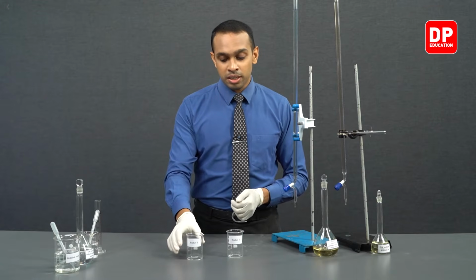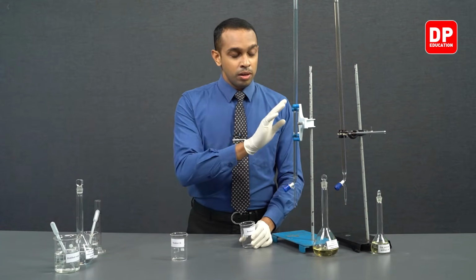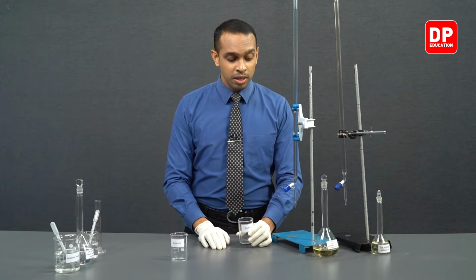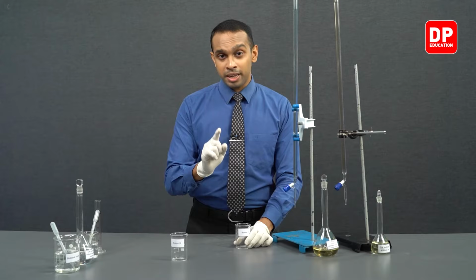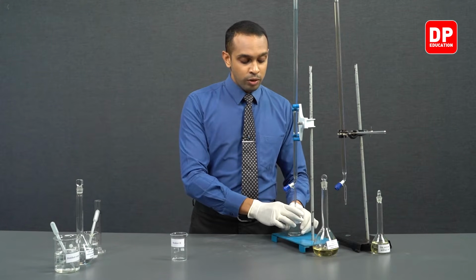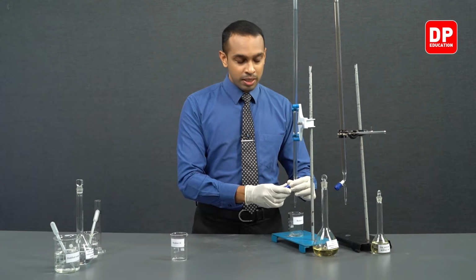As I mentioned earlier, to beaker 1, we need to measure our acidified Fe3+ ion solution. So if you take a look at your lab manual that you have with you, for the first reaction, you need to take 25 cubic centimeters of acidified 0.1 moles per decimeter cubed Fe3+ ion solution.